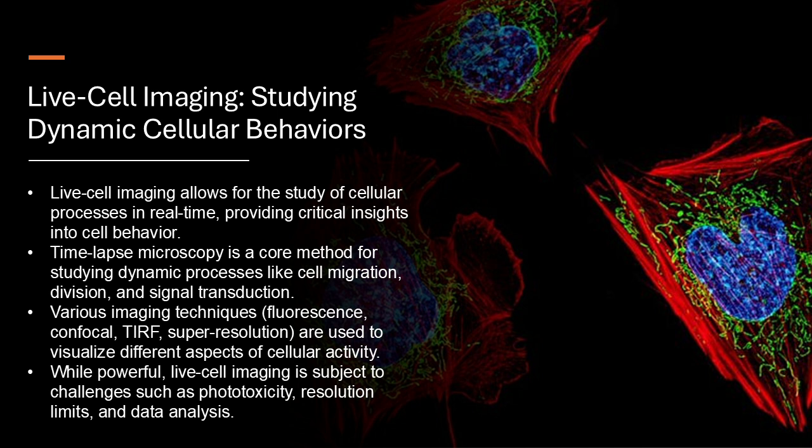What are you most excited about in the years to come? What are the big unanswered questions that you think this technology might help us address? Oh, there are so many exciting possibilities. One area that really fascinates me is the potential to use live cell imaging to study how cells respond to drugs in real time. So we could actually see how a drug interacts with its target inside a living cell.